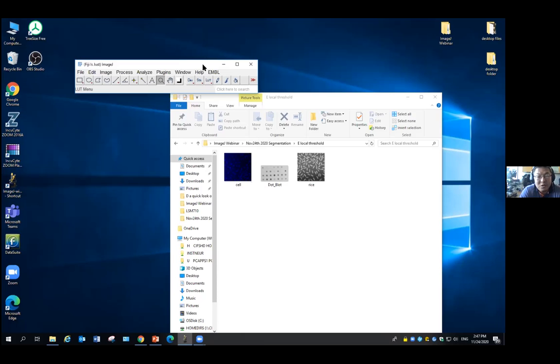All the algorithm does is calculate a value that it thinks is the threshold, then apply it to the whole image. That assumes the background level on your image is even, and many times this may not be the case.